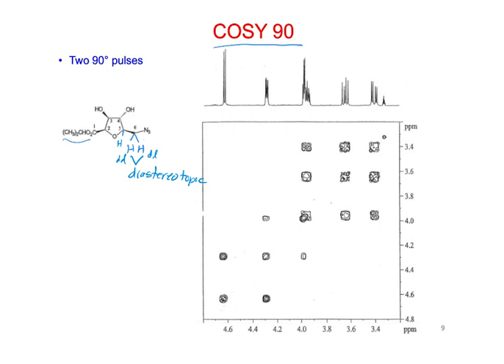So I don't think that's a bad place to start, but I don't think it's the peak at 4.6. Is it the one at 3.6? Could be the one at 3.6.